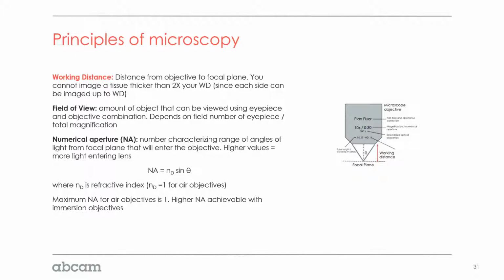that working distance depth. What's really important is as you increase your magnification, generally speaking, that working distance will go down. So for a 40x objective, you might only have a 200 micron working distance that you can work with. So while you'd love to image an entire mouse brain in 40x, you then have to slice an entire mouse brain into 100 or 200 micron sections to be able to do that. So there's some practical limitations associated with just objectives that dictate how far you can get into a tissue.